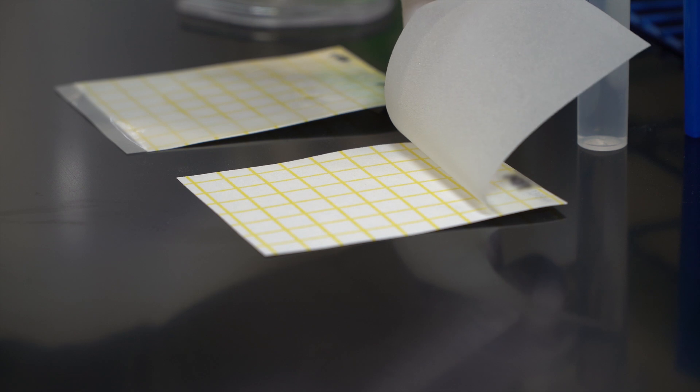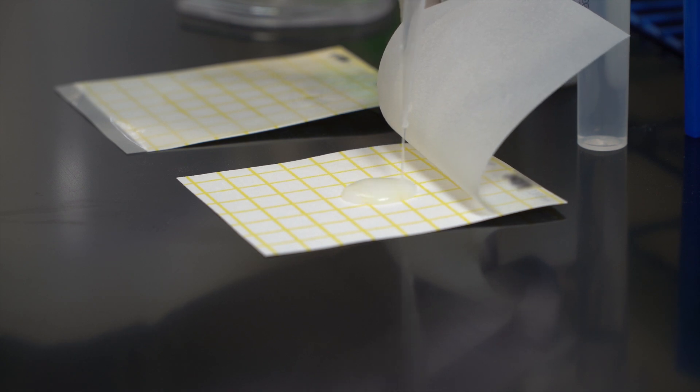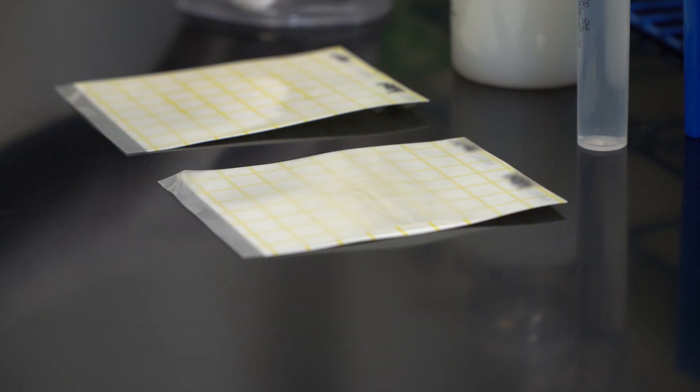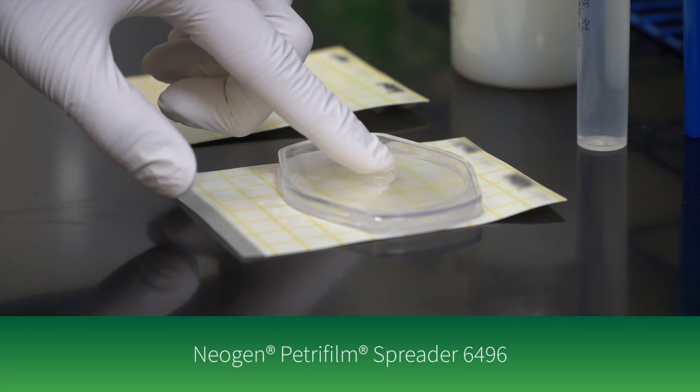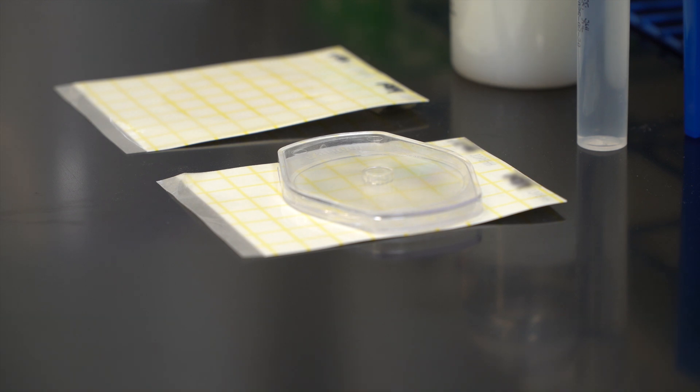For direct plating, lift the top film and dispense one milliliter of the sample onto the center of the bottom film. Drop the top film and place the Neogen Petri Foam spreader over the sample. Press gently to distribute the sample evenly.